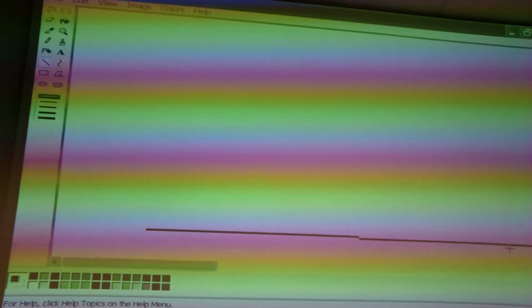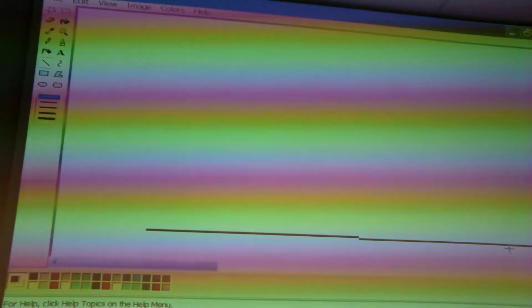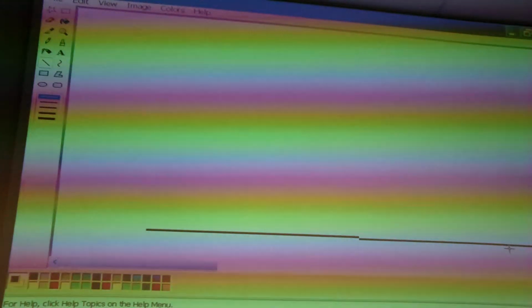Will that be the same as in the blood? Probably not. So if you apply just a cell culture supernatant to the bottom of this plate, the only thing you're going to bind, or 99.99%, is going to be albumin, which is essentially blocking the plates. You will find very little human IgG. So you need to find another solution. You could do the experiment, you will find a little, but it would be very, very insensitive.